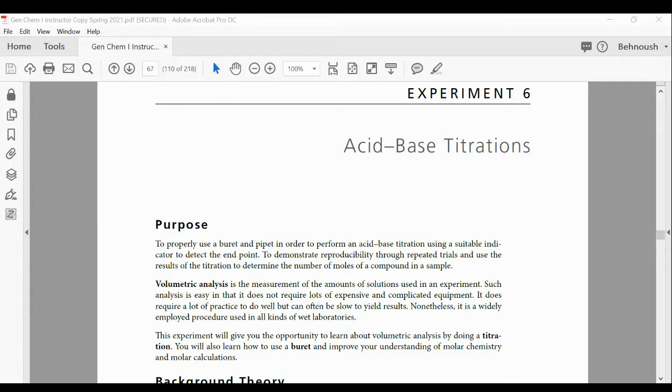Couple definitions. What is the endpoint of reaction? In a titration, what is the endpoint of reaction? The endpoint of the reaction would be the point that you stop pouring the neutralizer because the reaction is over. Is that the same as the equivalence point? Davis, you had the point where the two balance each other out and pH becomes neutral. Bianca, the point during titration when the indicator shows that the amount of reactant necessary for a complete reaction has been added.